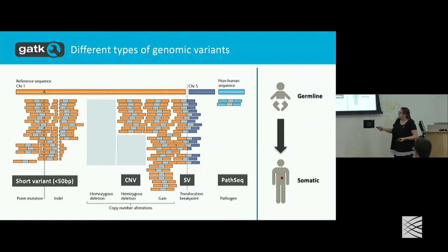And we could also have indels, which are small, less than 50 base pairs typically. Something that is either a small insertion or a small deletion that you could detect from short read data. So this very small deletion is missing a piece of the DNA that was in the reference, but it's small enough that we can see it within a single read. And that's kind of like the barrier of where we would consider it an indel versus a larger event, which would be a structural variant.